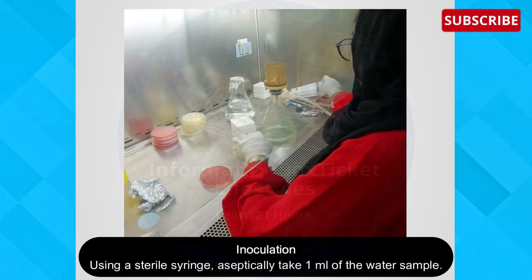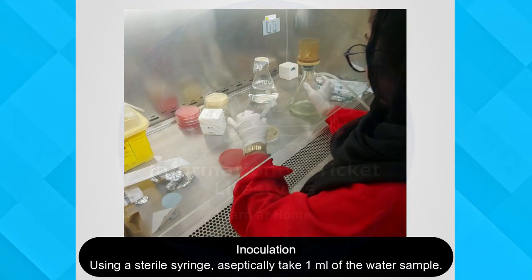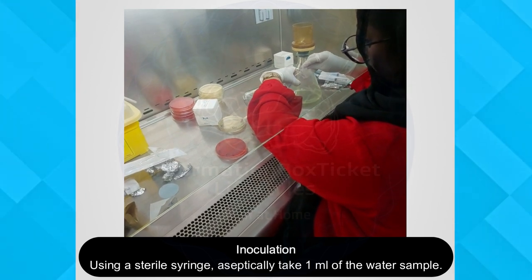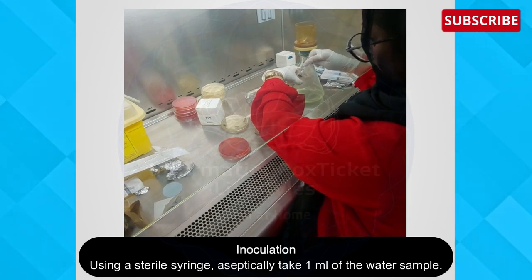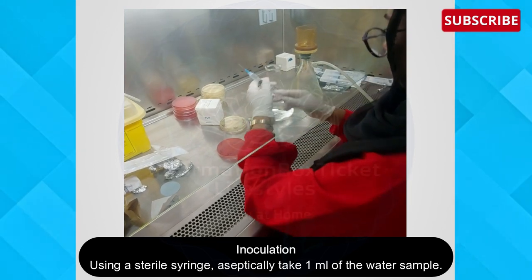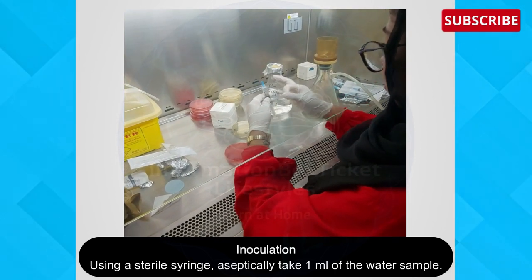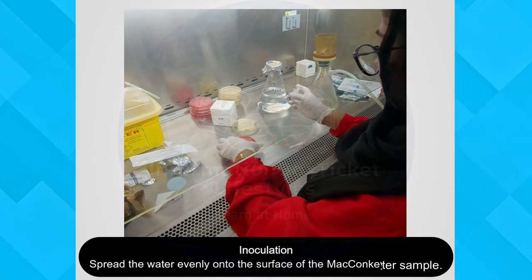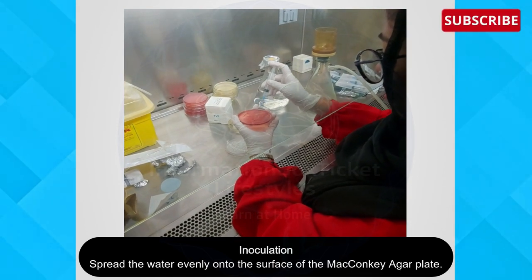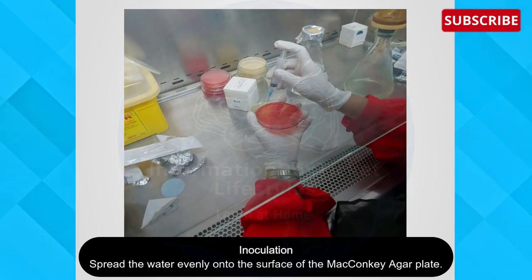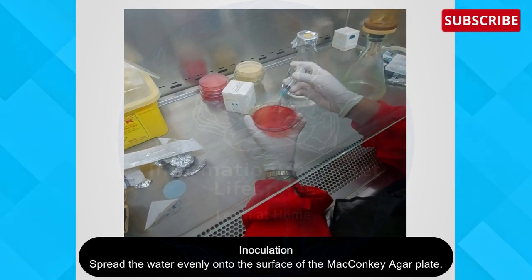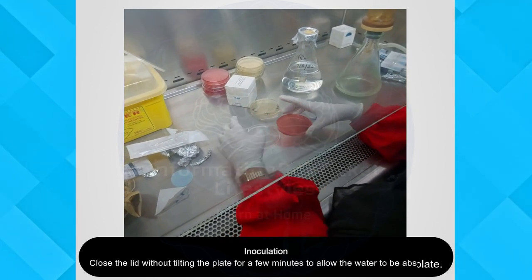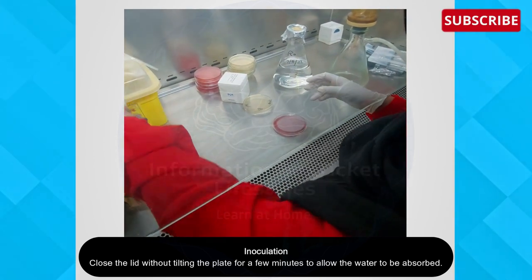Now let's begin with the inoculation. Using a sterile syringe, aseptically take one ml of water sample. Make sure you remove the air bubbles from the syringe. Spread the water evenly on the surface of the MacConkey agar plate. Close the lid without tilting the plate for a few minutes to allow the water to dry.